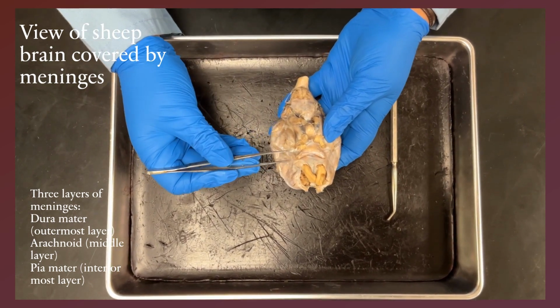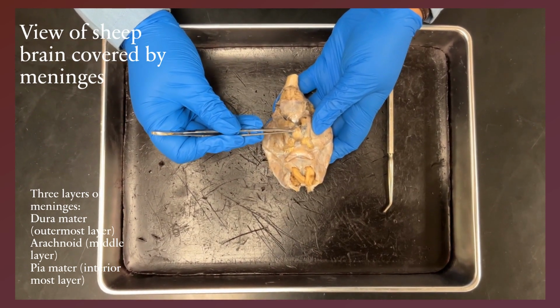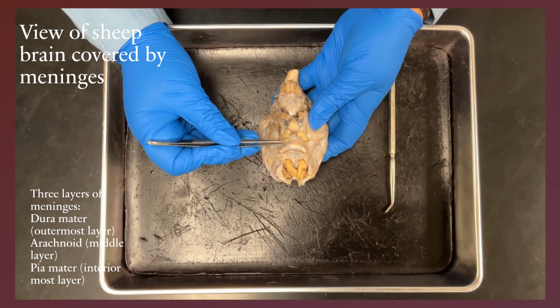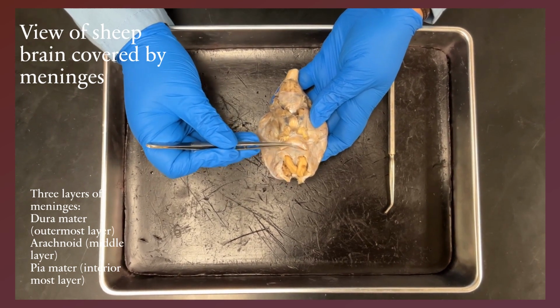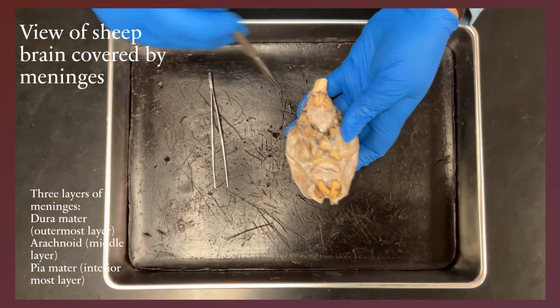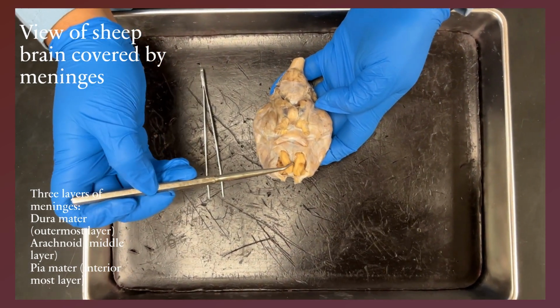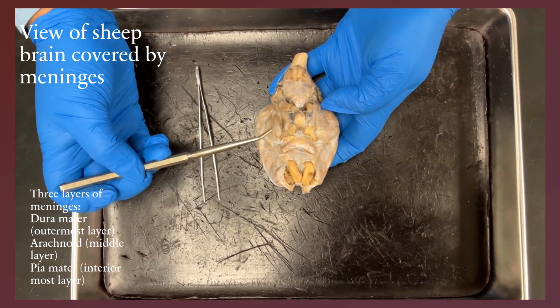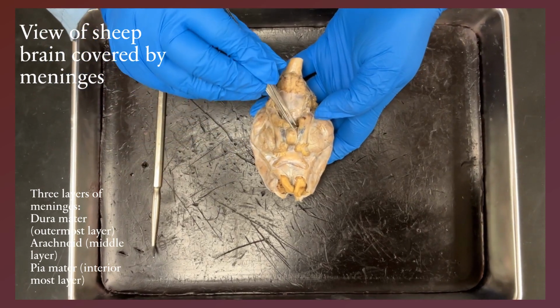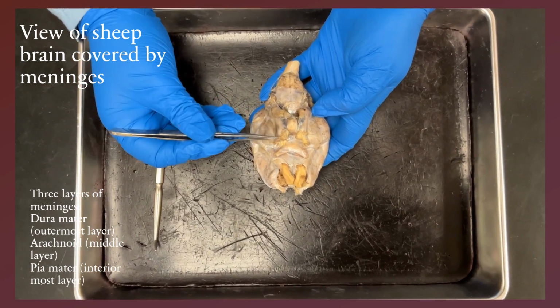Before we remove the meninges, make sure that you take a look at the pituitary gland, the location here. We can distinctly see the optic tracts where they cross over, the specific part called the optic chiasma. So this is the optic chiasma, there will be the optic tract. These are the olfactory bulbs. Once we remove the dura mater, we do not have much option other than taking the pituitary gland off. So I wanted to show you first before we remove the meninges.